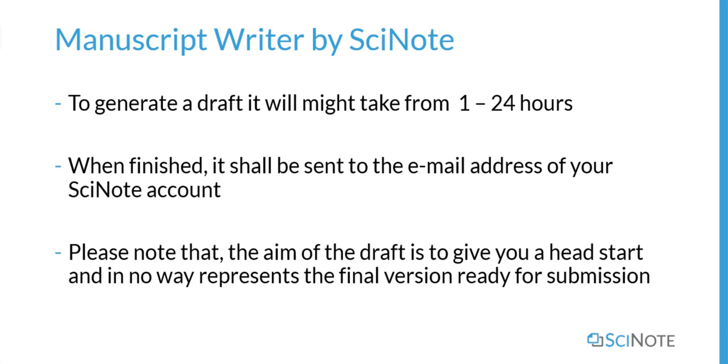Please note that the aim of the draft is to give you a head start and in no way represents the final version ready for submission.